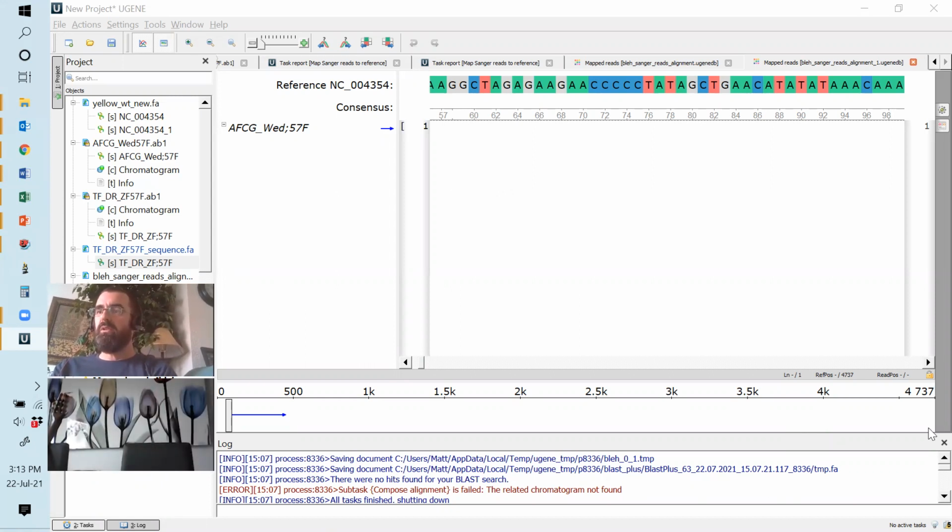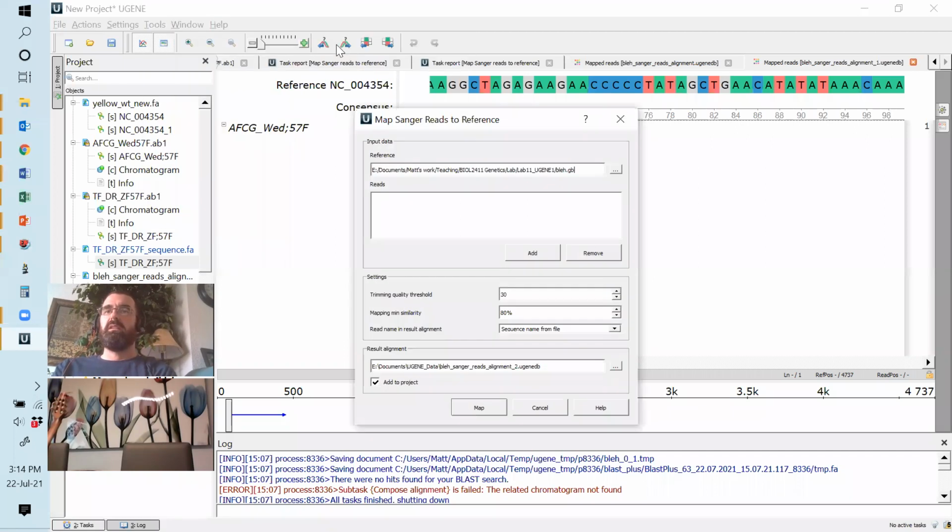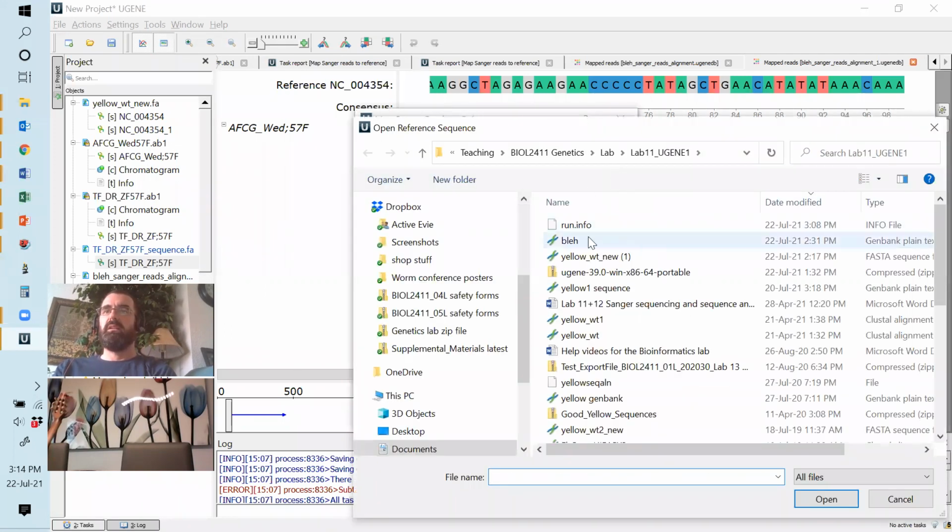Okay, so Dipper, hang on. I think you're adding the wrong sequence to the wrong place. So what you need to do is add two different sequences. One is your genomic sequence. Give me a second, Adam. Your genomic sequence, you see this box here, can you see what my cursor's pointing to, Dipper? Yeah. Click on that. That's what you need to select wherever you put your genomic sequence, the reference sequence, either from what I put on Dropbox or Blackboard or NCBI, it doesn't matter, wherever, right?